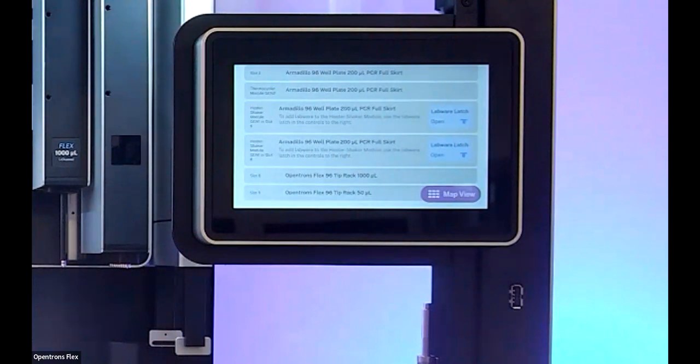Parth, again, will there be individual pipette nozzle control for a multi-channel pipette, or will all the nozzles be controlled together for a multi-channel? I actually was speaking with someone a day or two ago who's working in cell culturing, and she had requested this feature as well. This isn't something we currently support with our pipettes, but it is something we're looking into and hope to support on the Flex in the future.